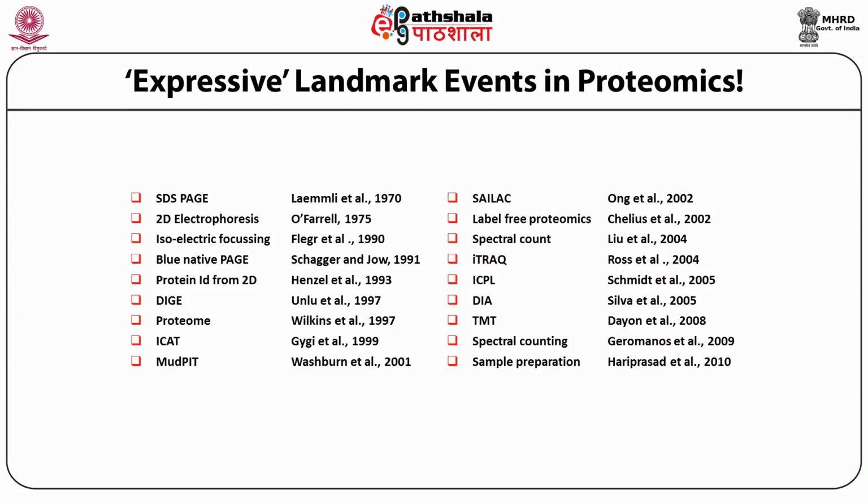Ever since the SDS-PAGE that was first introduced by Laemmli in the year 1970, there have been a lot of flagship research innovations in the field of proteomics. The entire list of these innovative techniques and procedures is listed in this particular slide for the use, reference and study by the students.